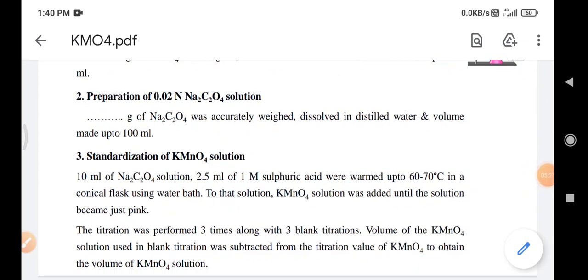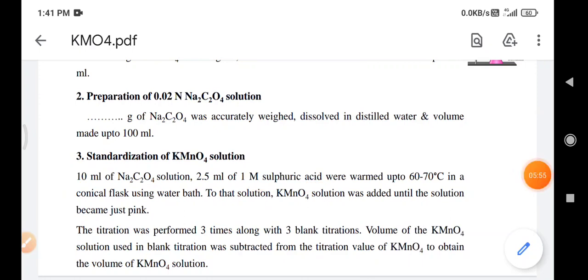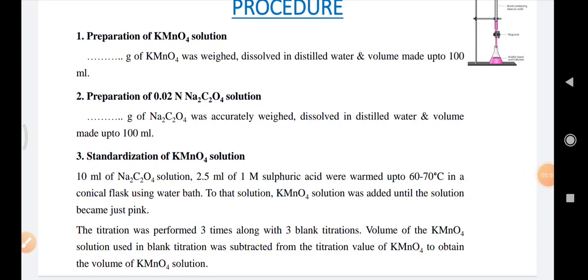For standardization of KMnO4 solution, 10 ml of sodium oxalate solution and 2.5 ml of 1 molar sulfuric acid — added to provide acidic medium — are warmed to 60–70°C in a conical flask using a water bath. KMnO4 solution is then added until the solution turns just pink. The titration is performed three times along with three blank titrations, and the volume used in blank titrations is subtracted from the titration volume to obtain the corrected volume of KMnO4 for calculation.